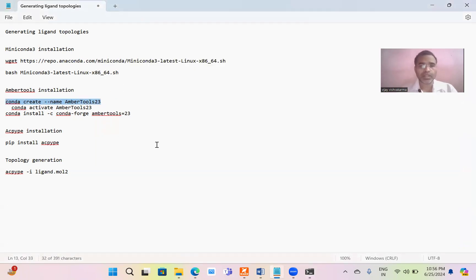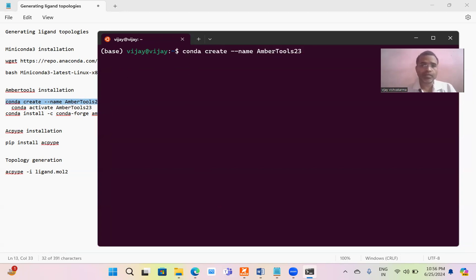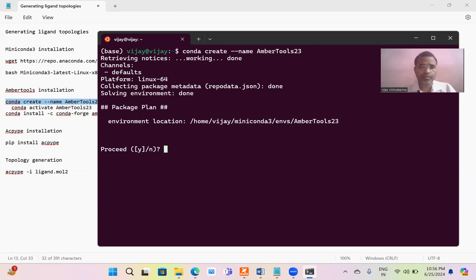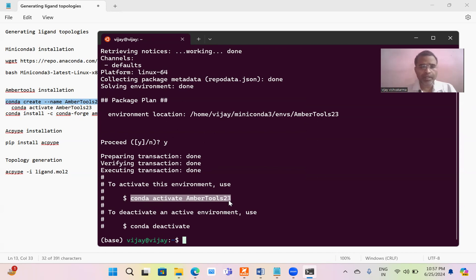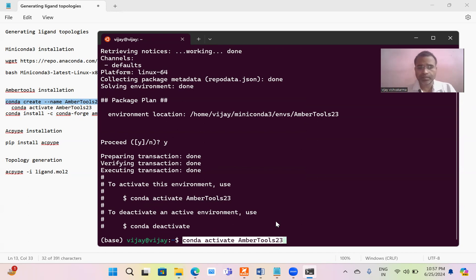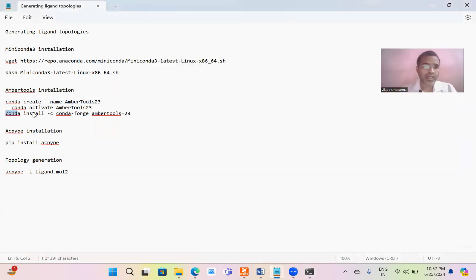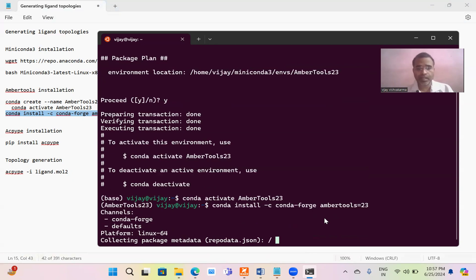Before going to install AmberTools, we have to create an environment named AmberTools23. Just copy and paste this. Press Y and enter. It is asking you to activate AmberTools23 environment. Finally we have to install the AmberTools. Just copy and paste it. Press enter. It will download the AmberTools package and install AmberTools for you.